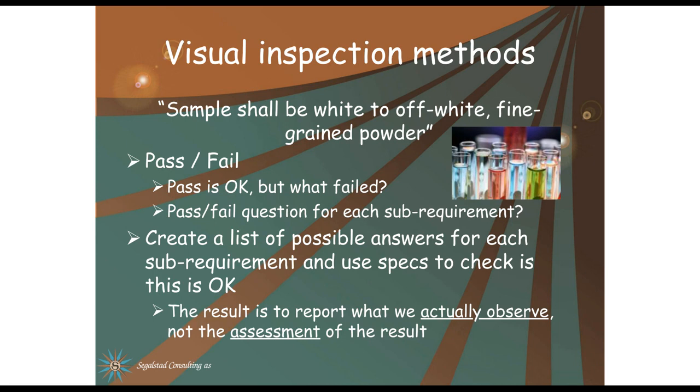We shall implement this as observations for each of the requirements. After all, it's a visual inspection method. We do not observe pass or fail. We observe if the sample is white, off-white, or another color. We observe if this is a fine-grained powder, however that is defined.